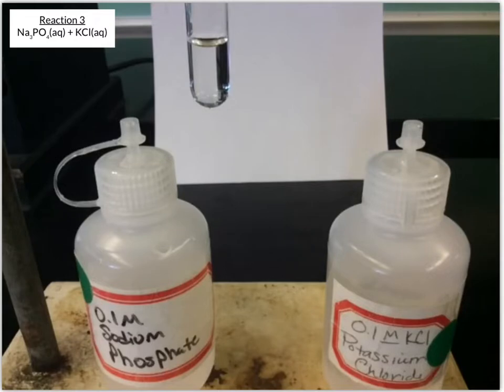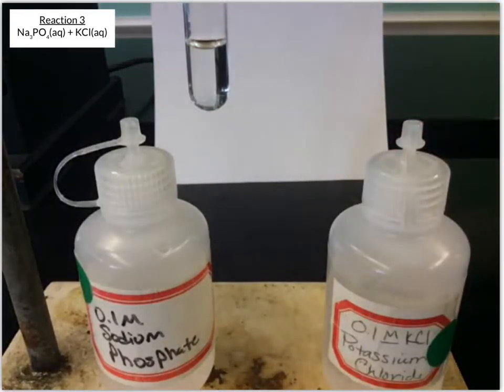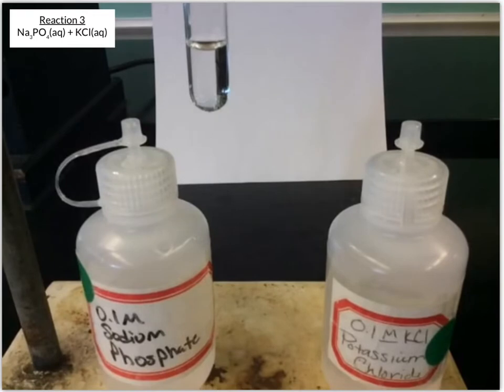Okay, so we started with 2 clear colorless solutions, and it looks like we still have a clear colorless solution. And so it doesn't appear that anything happened and there weren't any bubbles formed or anything like that. Just when we first mixed that, and also the test tube is not warm or anything. So based on the observations, it appears that nothing has happened. Now you can still look at the actual substances and predict should something actually be happening that is unobservable.